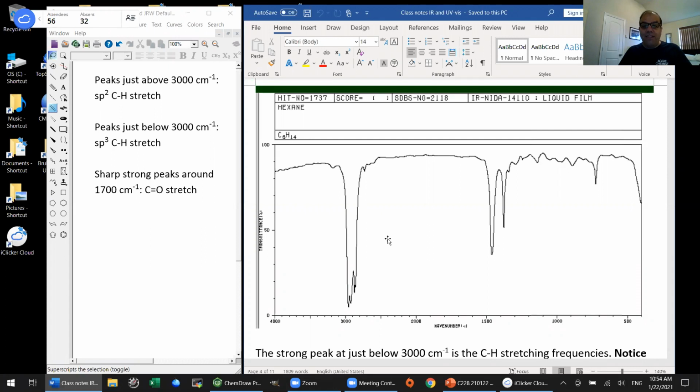So this could be considered pretty much the presence of absence, if you will, when it comes to an IR spectrum. This is what you will get if there really are no functional groups to speak of. Here we have just a saturated hydrocarbon. The main thing that jumps out at me, and I hope will jump out at you with practice, is we see all of these pretty strong peaks below 3,000 wave numbers. And I don't know why the dividing point turns out to be pretty much exactly 3,000, but it does.